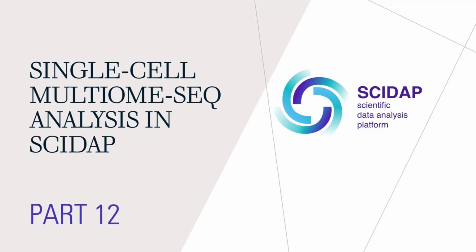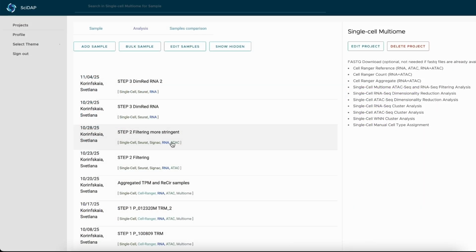You are watching the single-cell multiome analysis series with SciDAP. It is our 12th tutorial video and we are continuing the analysis of the example dataset using the single-cell multiome pipeline. We already finished the dimensionality reduction step for the RNA part and now we will start the clustering.